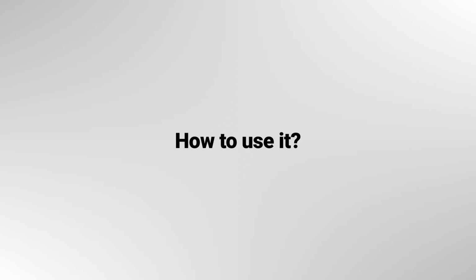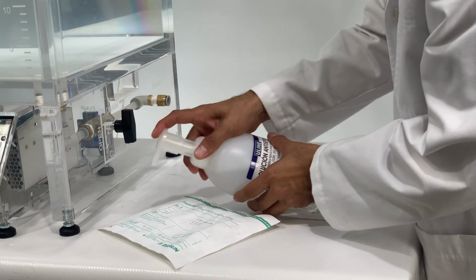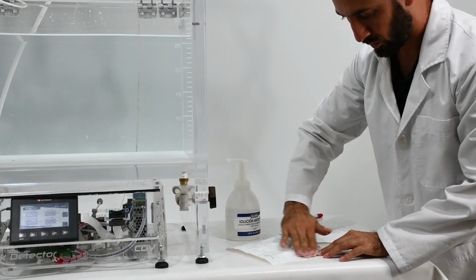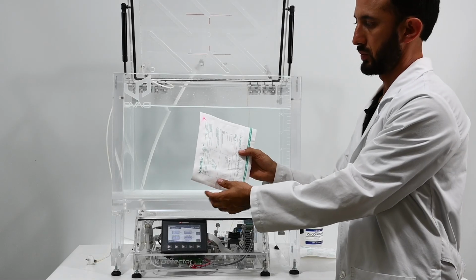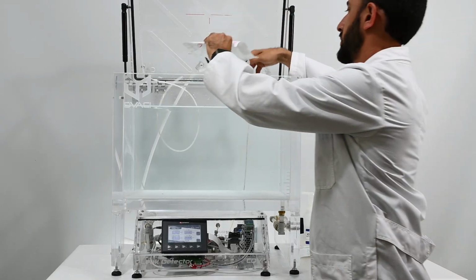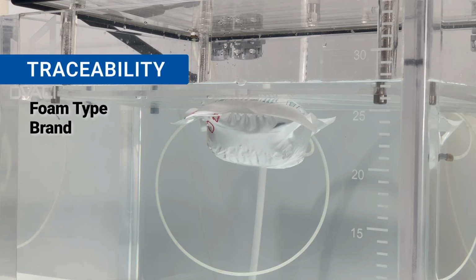How do you use it? It's very simple. Prepare the sample according to your procedure. Clean and dry the porous surface. Apply the foam in an even layer over the entire porous area. Then, let it dry for about 15 to 20 minutes. Now, go ahead and run your internal pressurization test using the parameters from your procedure. Record the essentials for traceability: type of foam, brand, batch number, and drying time.